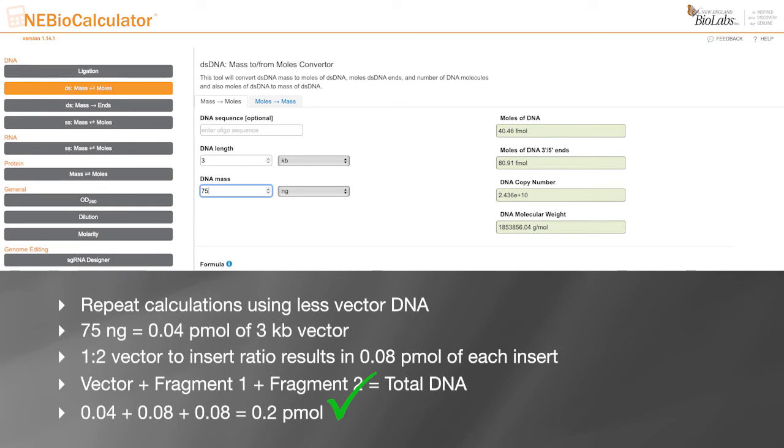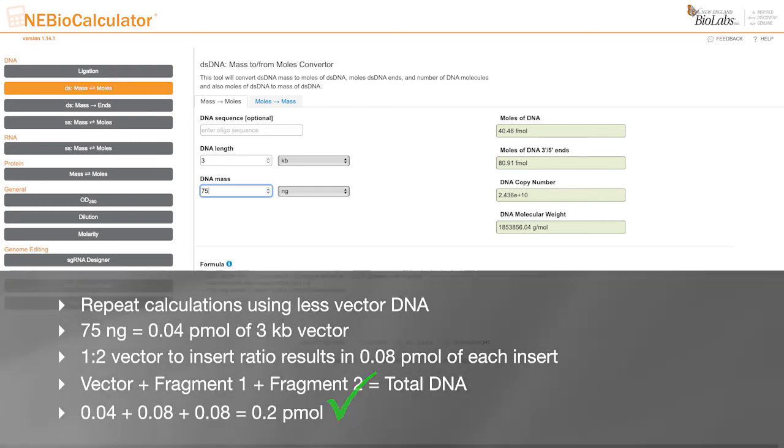You may need to use a larger starting mass when working with large vector fragments greater than 6 kb.